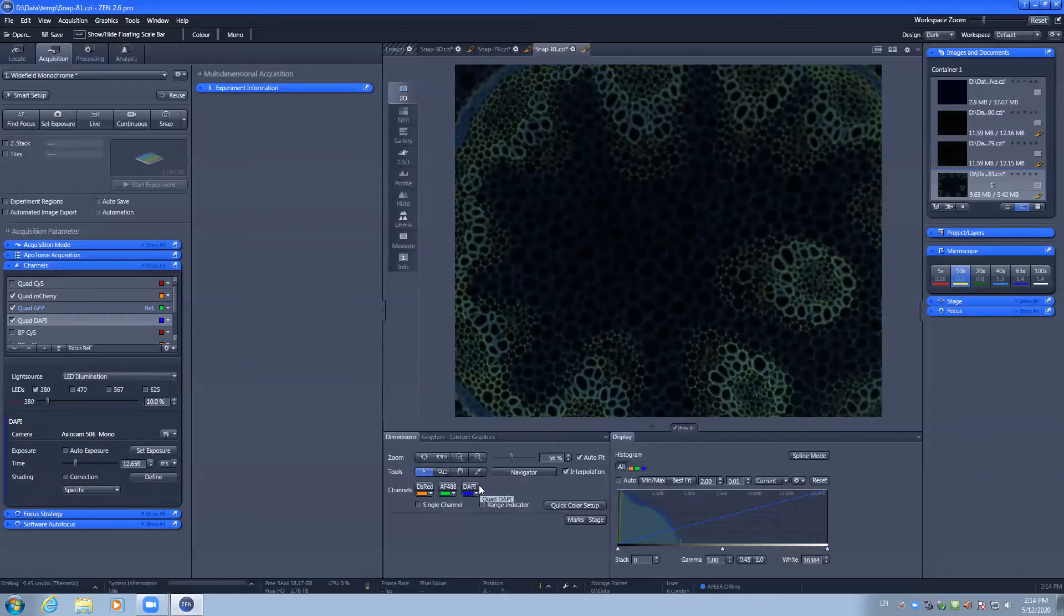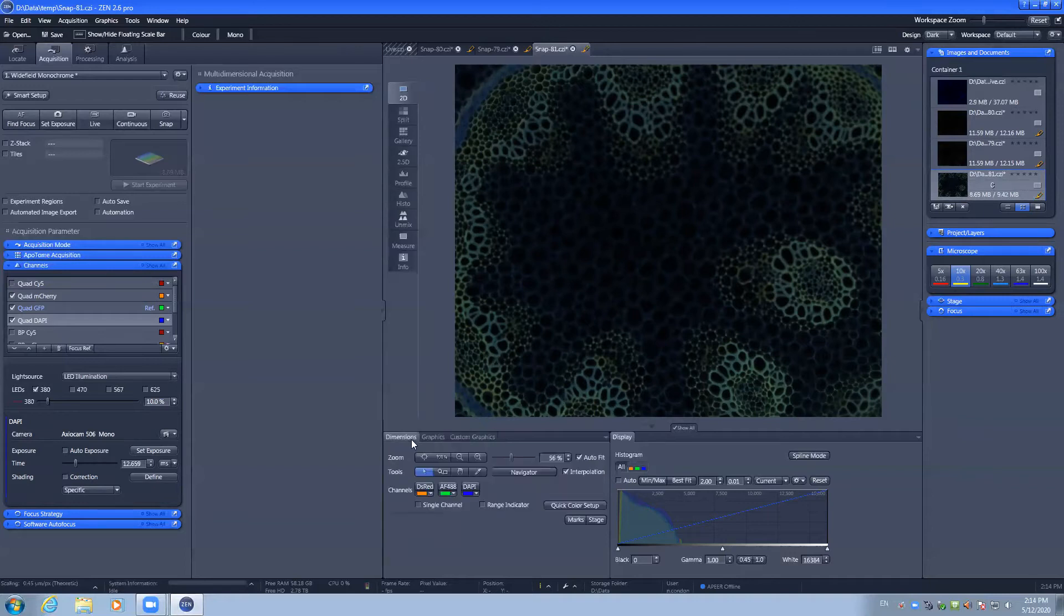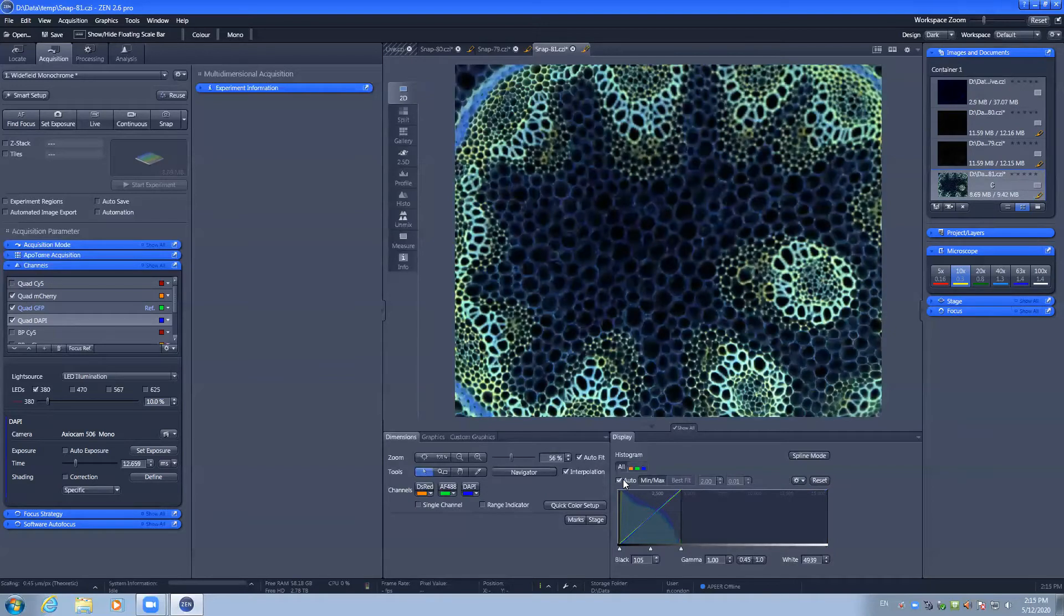Down the bottom, we have our tools to see the dimensions of the image, to add custom graphics, or to adjust the histogram to display the image.